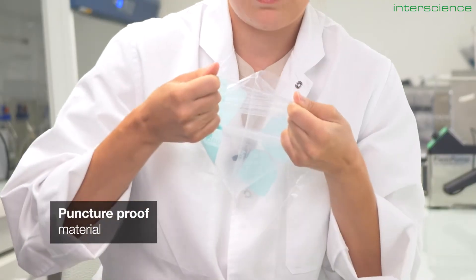We designed a wide range of formats to accommodate all sample sizes, and we purposefully selected resistant materials to protect them throughout the analysis.